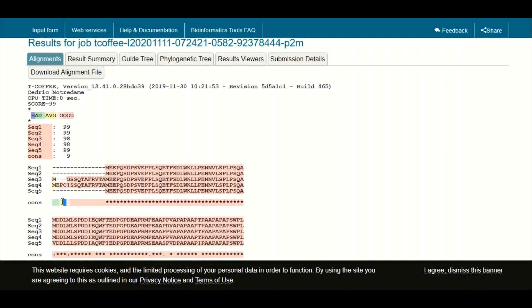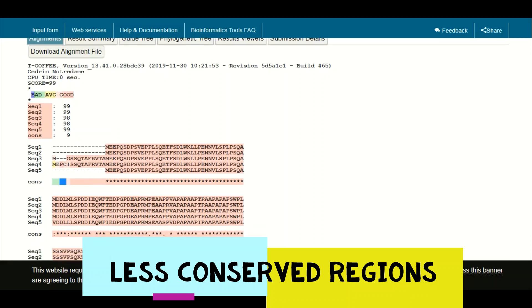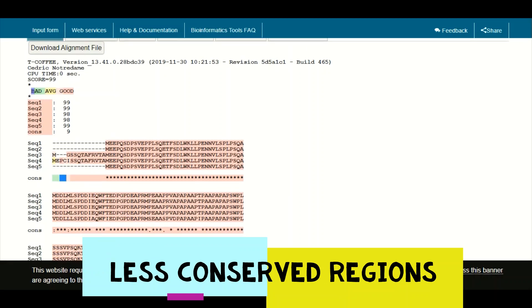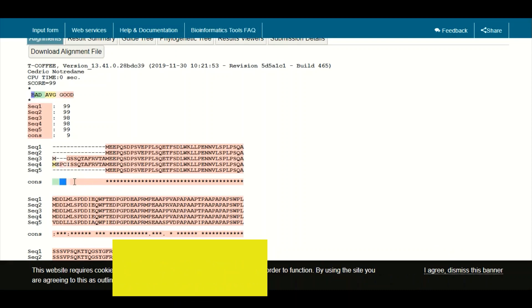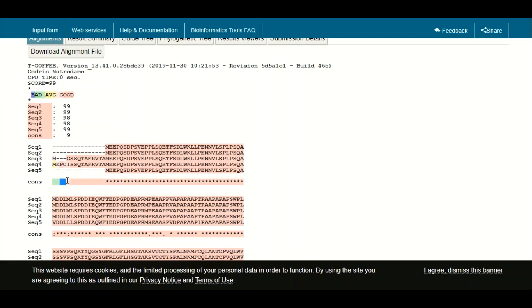Regions shown in green or yellow are not under very high selection pressure — they are under moderate or low selection pressure. These are regions which are not very critical for the function and structure of the protein.